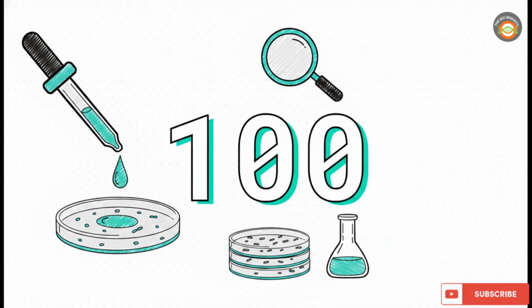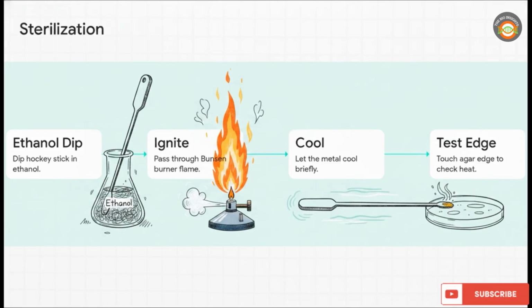Once those safety checks are complete, we are back to facing that microscopic scale. Stephanie pipettes just 100 microliters of her pre-diluted bacterial liquid and drops it directly onto the center of a fresh agar plate. It's just a tiny bead of liquid, really, but it holds all our target cells. So how do we spread that tiny bead around evenly without introducing a bunch of new germs from the air? Well, we use a glass or metal tool, appropriately called a hockey stick spreader.